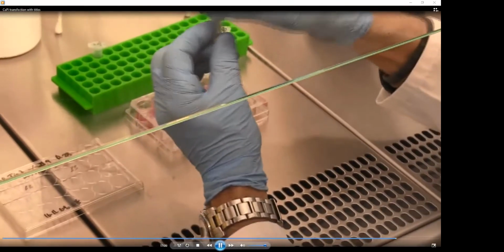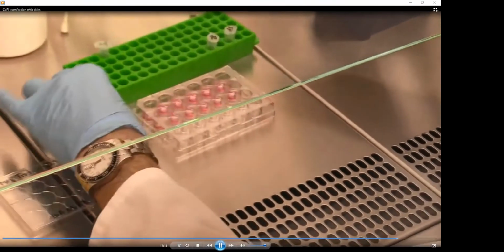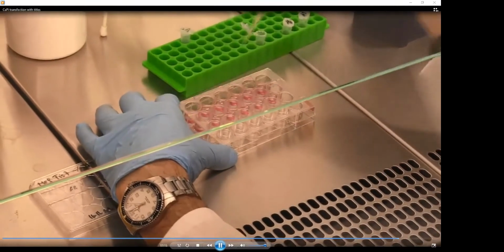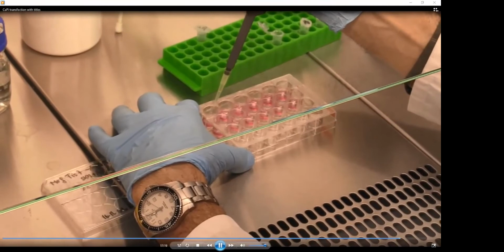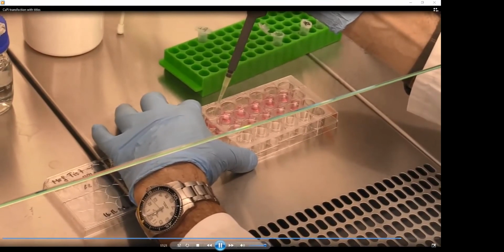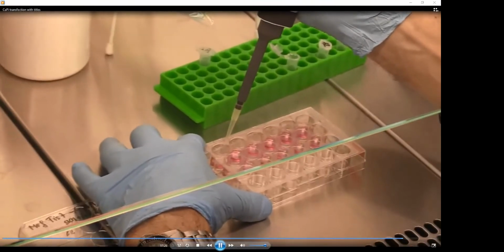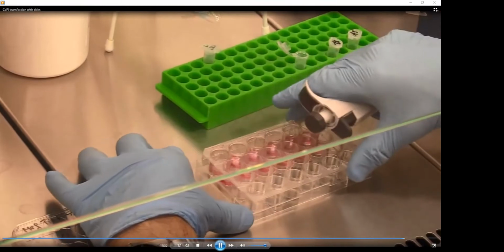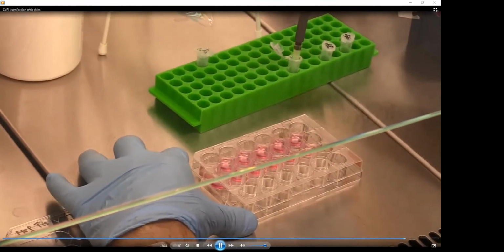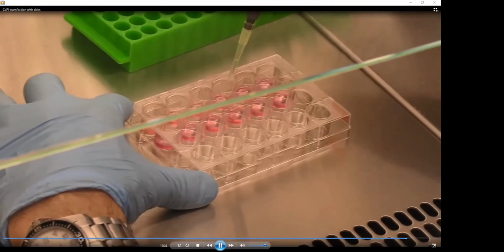So now we add the mixture once again dropwise, and important is to know how much. So it's 80 microliters of the transfection mix per well. And don't rush in this step, do it always dropwise and try to distribute the sample all over the well so that it gets the best chance to interact with all cells in your well.